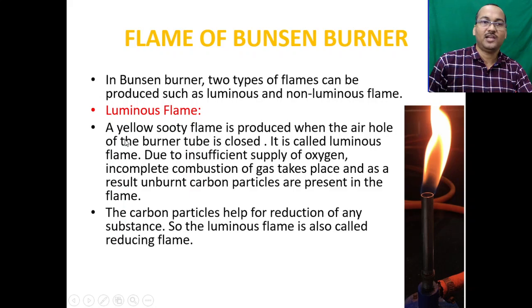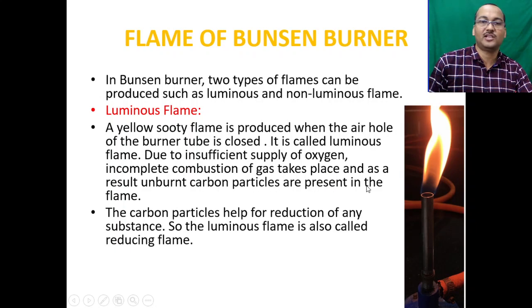A luminous flame is a yellow sooty flame produced when the air hole of the burner tube is closed. You can see the yellow sooty flame here. Due to insufficient supply of oxygen, incomplete combustion of gas takes place, and as a result, unburned carbon particles are present in the flame. These carbon particles aid in the reduction of substances, so the luminous flame is also called the reducing flame.